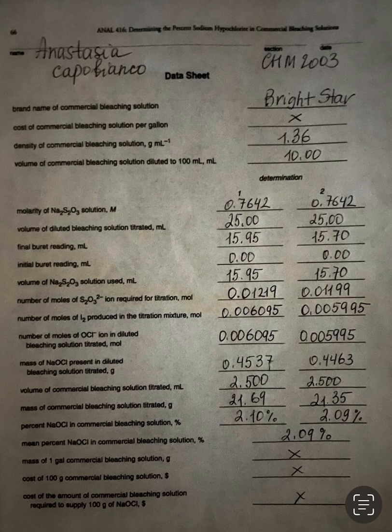Remember, we put 25 in one and 25 into the second one. So that number I kept the same. The numbers for the final burette reading and the initial burette reading are my created numbers. I just wrote whatever number, and I calculated the volume of sodium thiosulfate used in the titration.